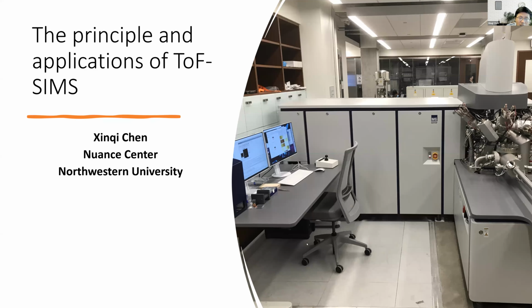But through the presentation, or probably you already got training before and learned something, compared to other methods like SEM and XPS, the ToF SIMS is a little bit complex in operation, especially for data analysis.